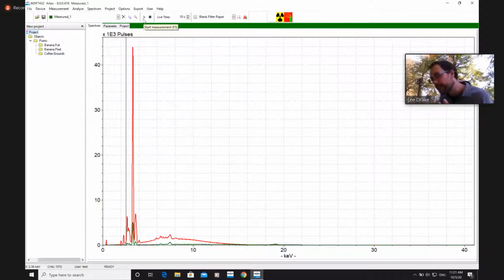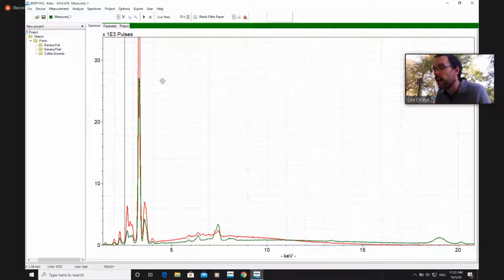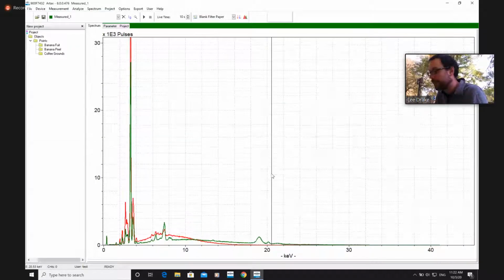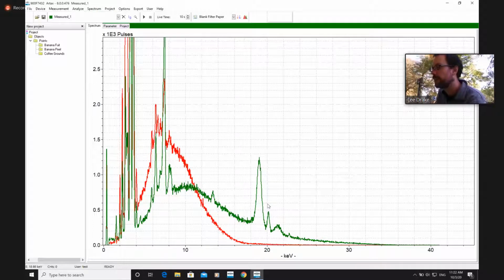Now in red is our 15 keV spectrum, and in green is our 40 keV spectrum. What you'll notice immediately is we've got a lot more photons out here by 20 keV. Do you also notice that the potassium peak for the exact same coffee grounds is half as high as it was before? When I reduced my energy to 15 keV, I was focusing on potassium, so the exact same object gives me a higher signal because I'm not wasting all my X-ray photons on different parts of the spectrum. But in lab rat mode, I can see more peaks out here where my other spectrum trailed off. In this case, I see these 3 over here.